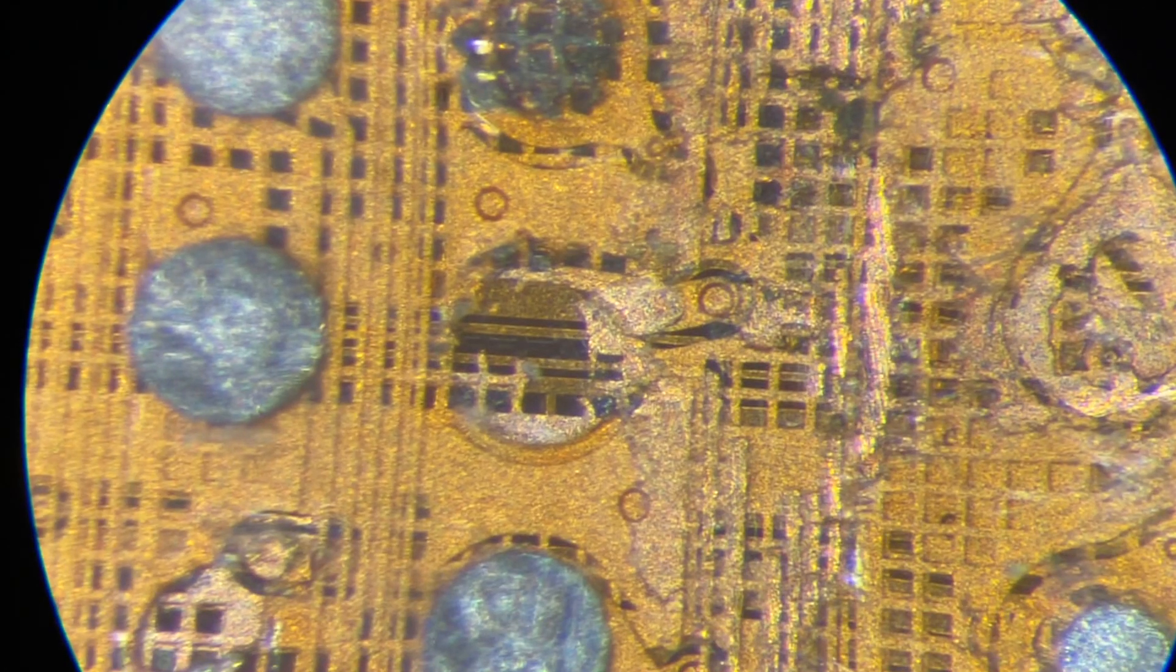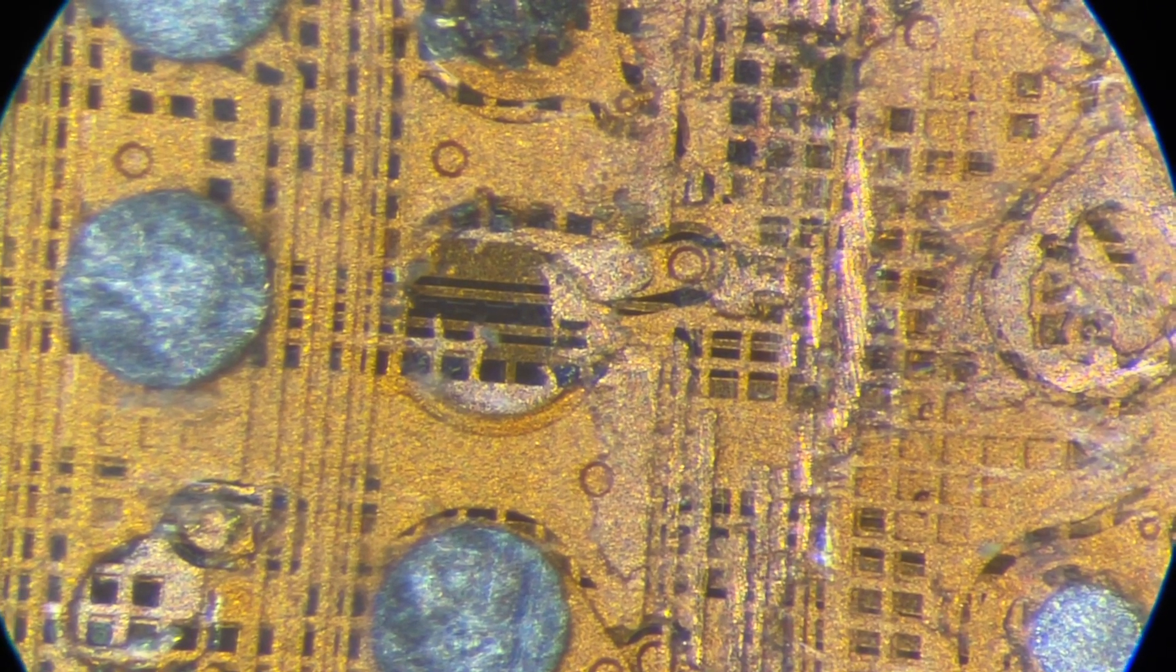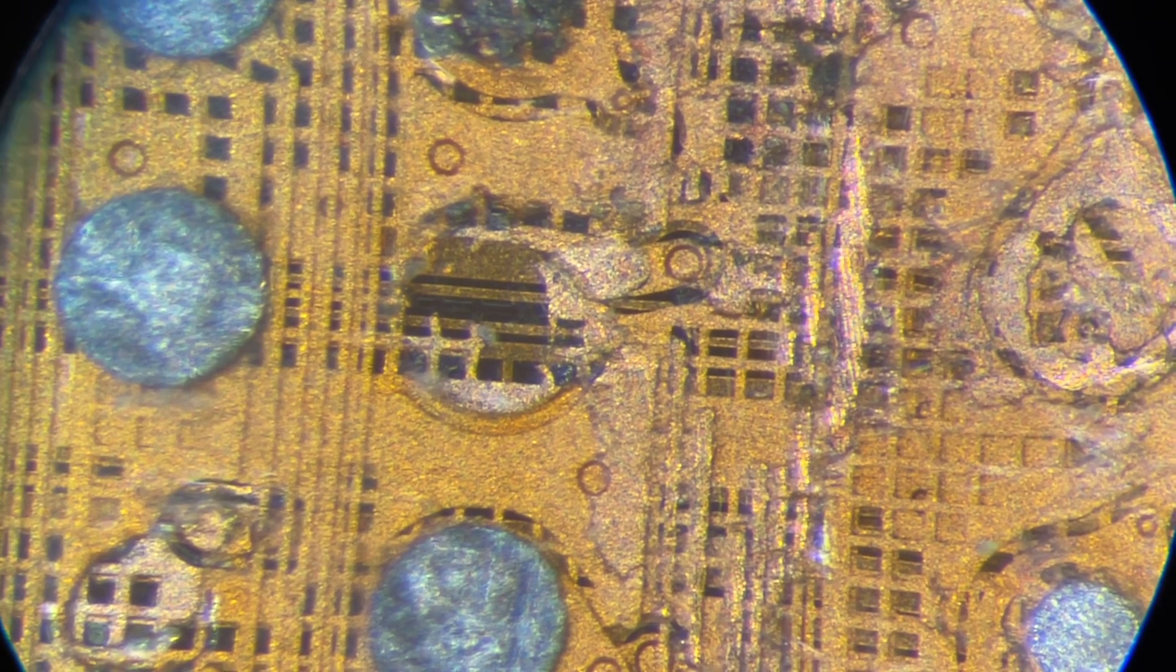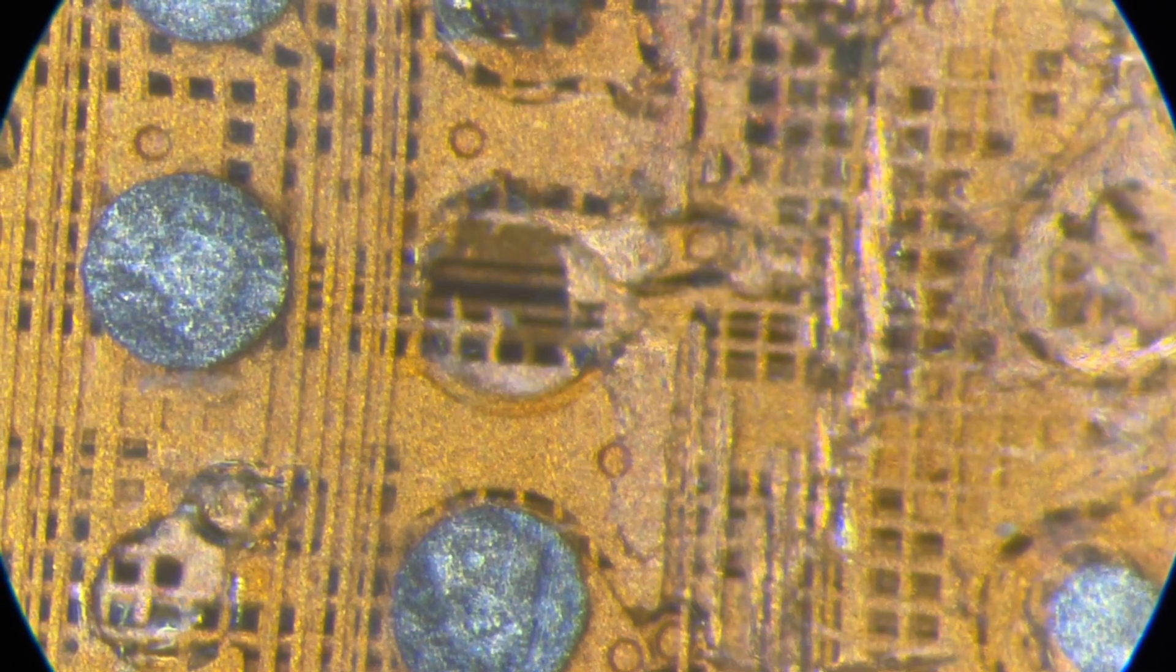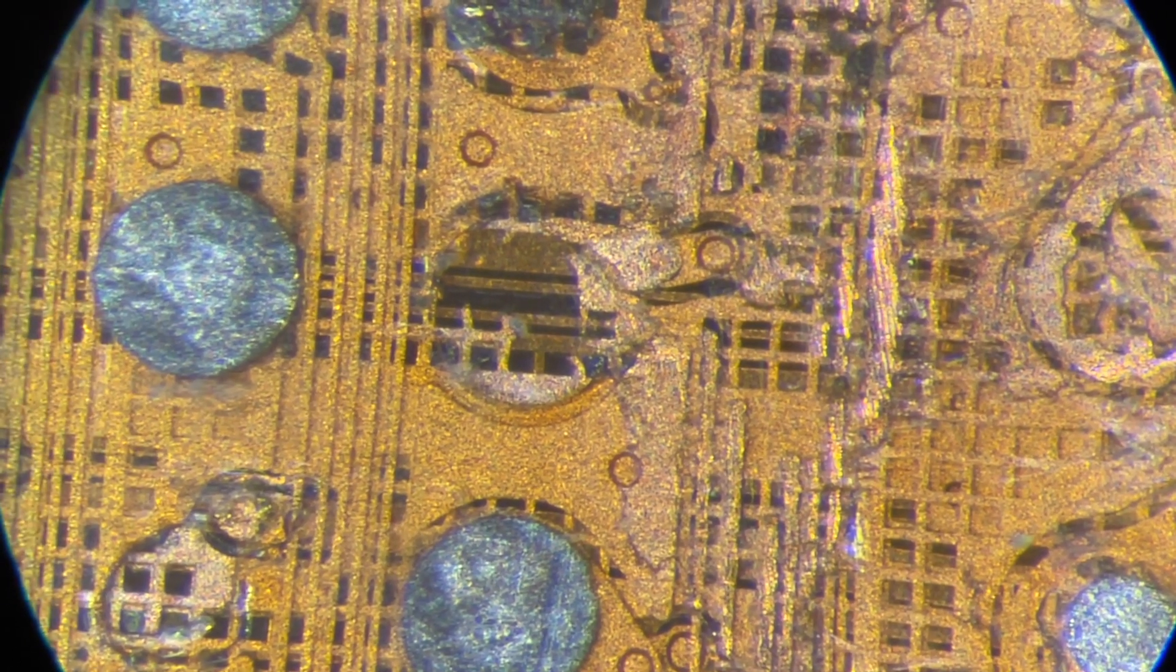But to get real resolution, I'm using a 20x eyepiece from Olympus. So technically now, the field of view is twice smaller as regular, but we can see the real resolution this objective offers. So let's start with things we've already seen.